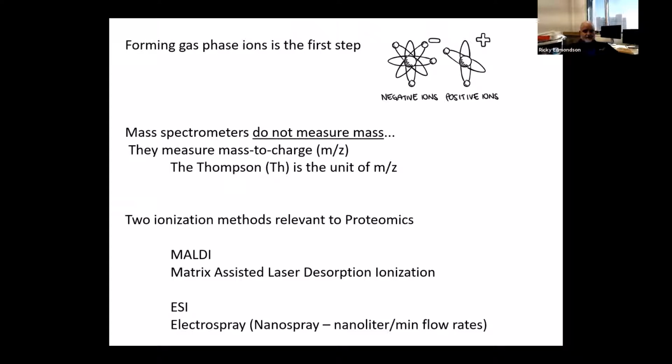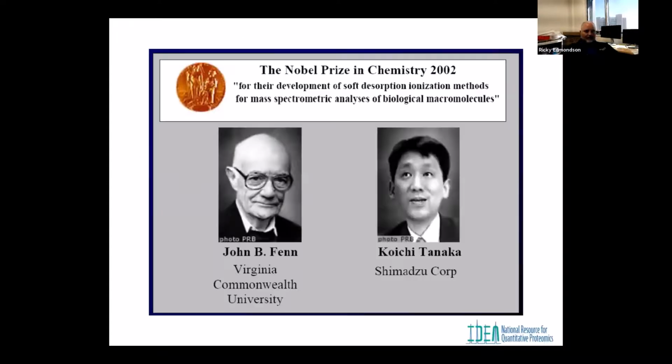The ionization methods that really made it possible for a mass spectrometer to be used with biological samples were MALDI, or matrix-assisted laser desorption ionization, which really now is only being used in proteomics to do tissue imaging. It's still viable, and it hurts me a little bit because my doctoral work was on that. If anybody is just curious about gas phase acidity or basicity of organic molecules and how they transfer charge, I can put you to sleep. But the real meaningful technique now is electrospray.